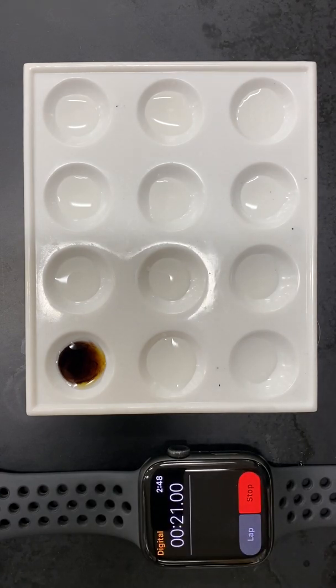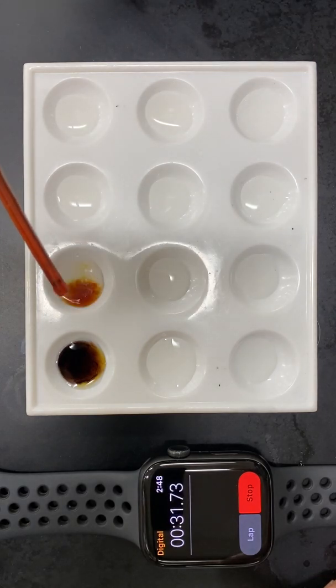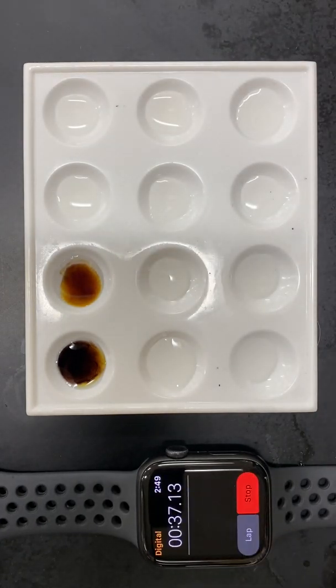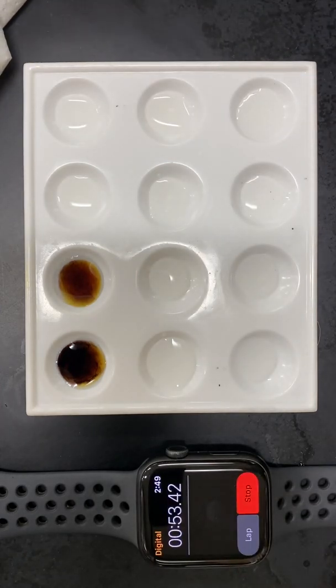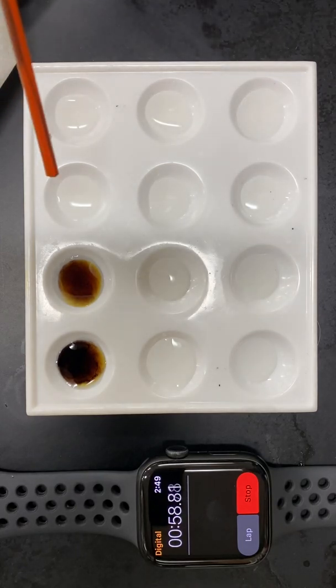I realize that this is long and boring, and well, that is this part of the lab. So it is approximately 30 seconds. I'm going to add a drop right now. And I just spilled some iodine, so that's not good. So I'm going to go grab a paper towel quick. Scooping that up, I'm going to get ready to add another drop.